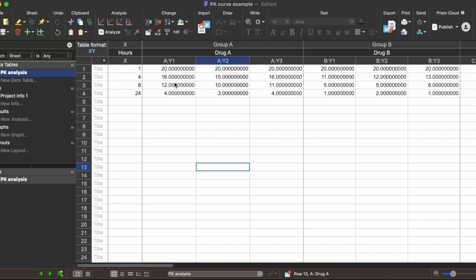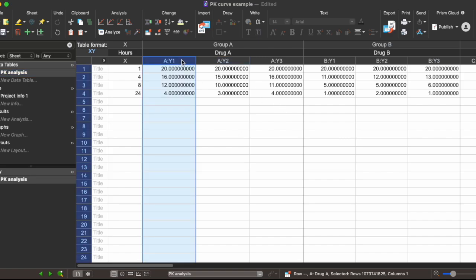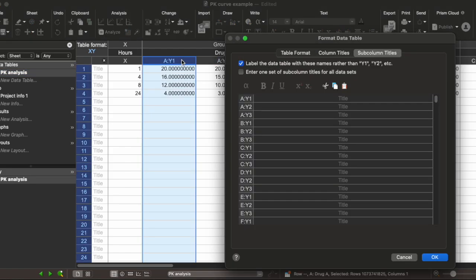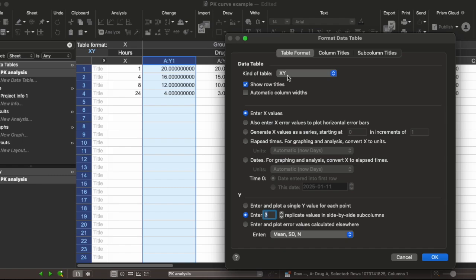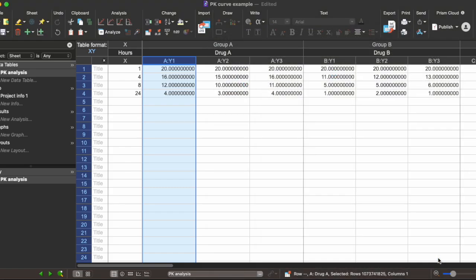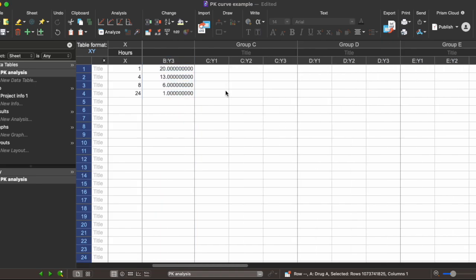If you have more than three replicates, you can add more just by double-clicking the sub-column, going to table format, and increasing the number of Y replicate values you want to display in your side-by-side sub-columns. If you have more than two groups, you can always just enter your values in group C, D, and onwards.